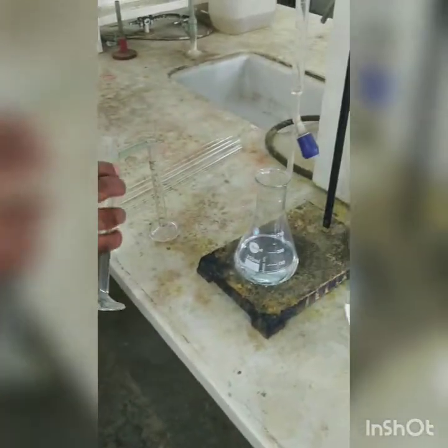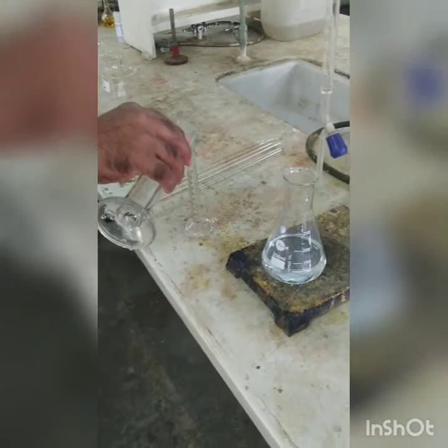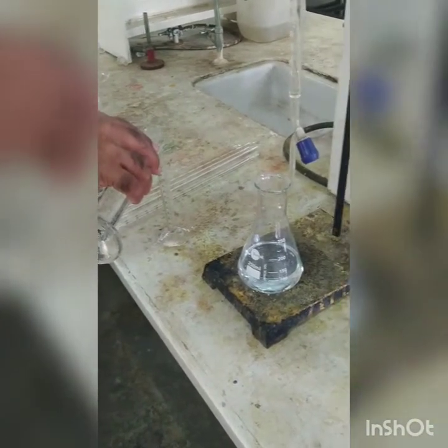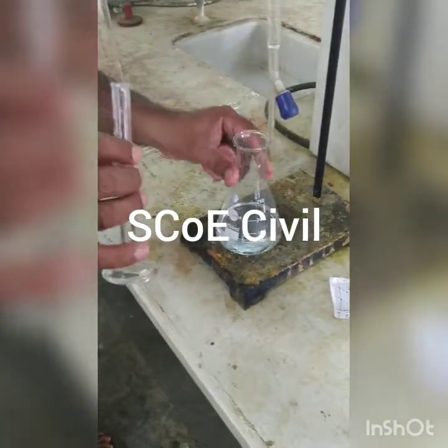So add 9 ml of distilled water. So this is 10% H2SO4 solution, and 10 ml of 10% H2SO4 solution is what we are supposed to add to the conical flask.